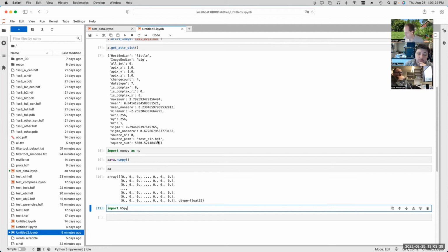And no, nobody that I'm aware of has written an abstraction layer on top of the HDF5 library. The problem is if you're going to write a generic library for reading, say, an MRC file, how do you return the results? You could say, okay, you can read it from the file and I'll present it to you as a floating point array and a dictionary of metadata objects, maybe. But there are so many different ways you could present the information that it's almost not worth the effort.